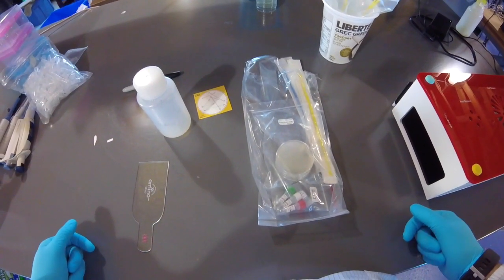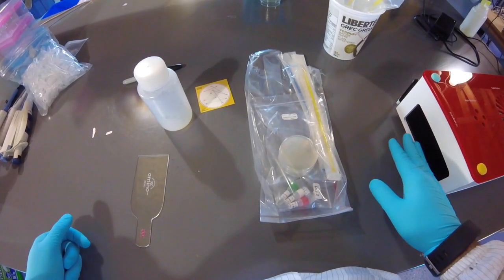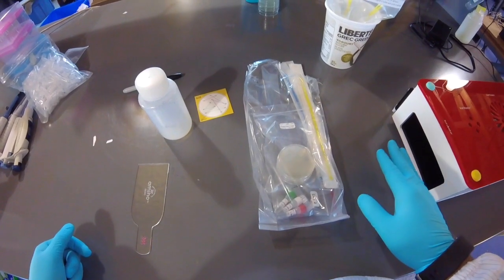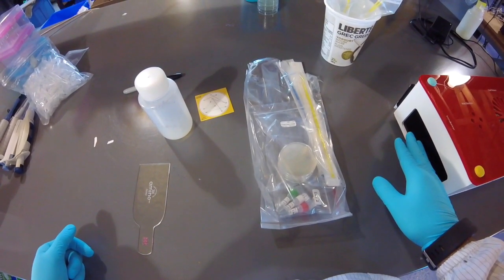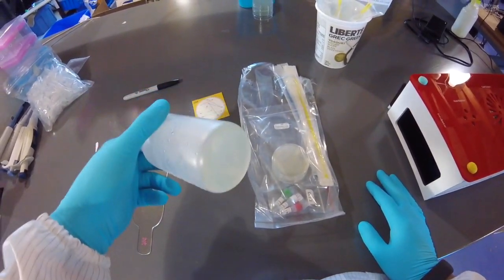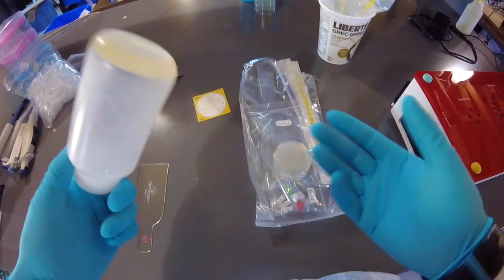All right, so we left off yesterday putting our cells into the incubator on our negative control selective plate and our non-selective plate with the blank cells. And we finished off with a bottle yesterday. There was a little bit of agar left. I didn't mention, but you can hang on to this.